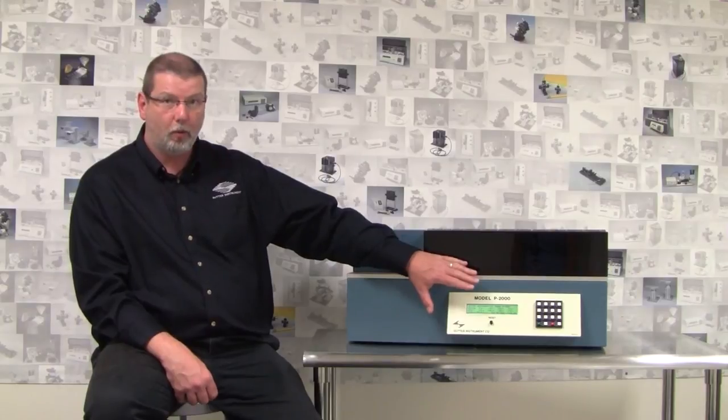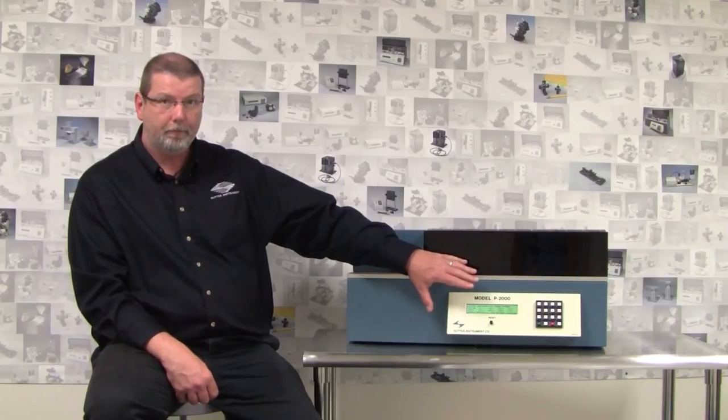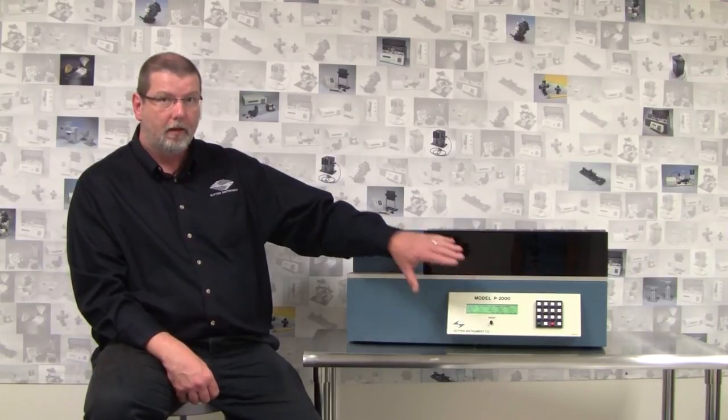Going forward we will produce a series of tutorial videos that will show and deal with what happens if you change individual parameters of the pull program. The title of the series is Program 71, simply because that's the program number that we used during the production of the video footage.